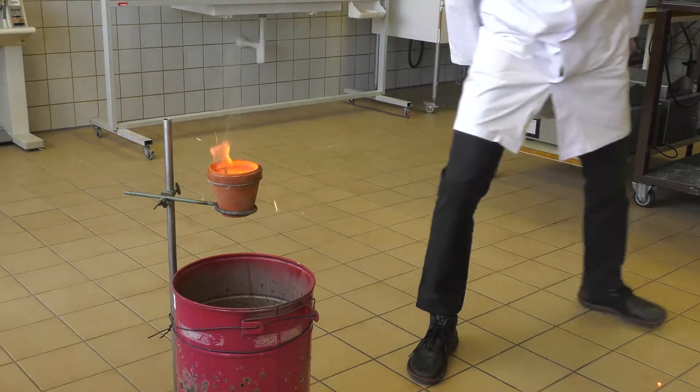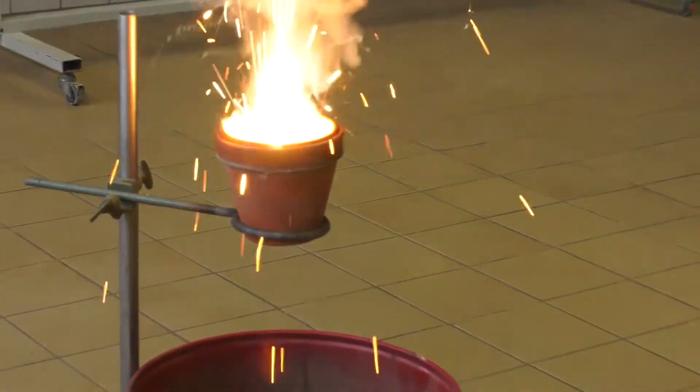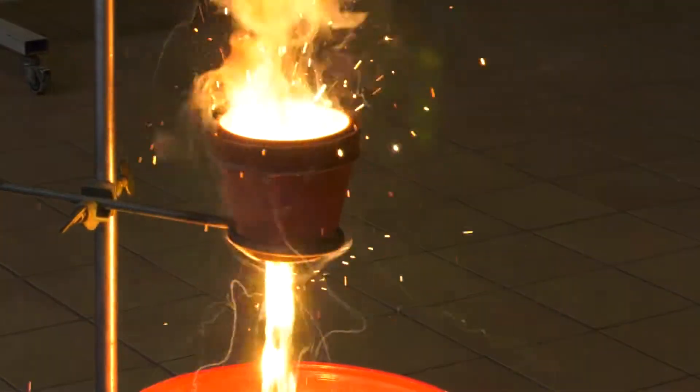Now you can burn the sparkler and add it to the mixture. The sparkler is needed to bring the starting temperature of the reaction.